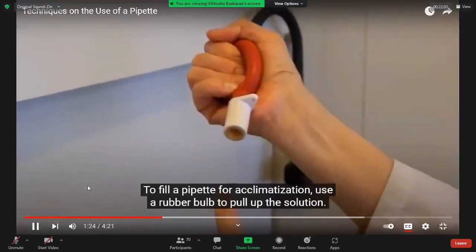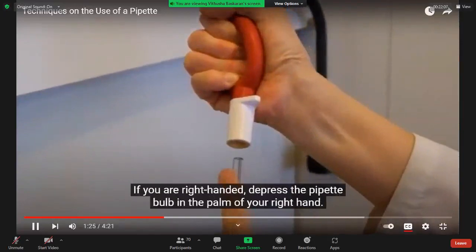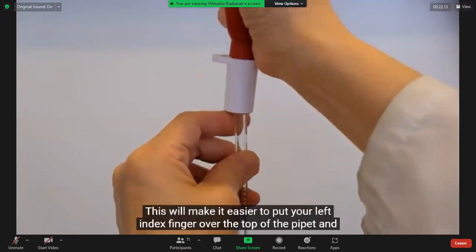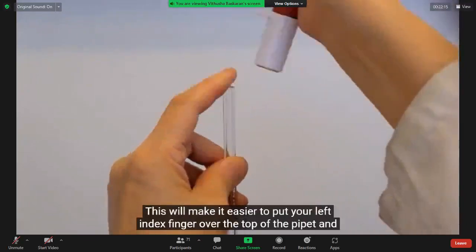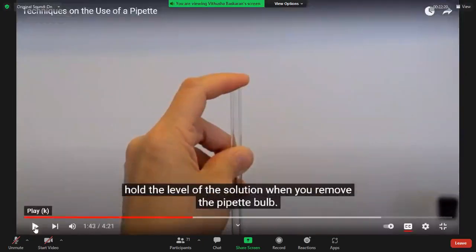Pull up the solution. If you're right-handed, depress the pipette bulb in the palm of your right hand. Hold the pipette in your left hand, but keep your index finger near the top of the pipette. This will make it easier to put your left index finger over the top of the pipette and hold the level of the solution when you remove the pipette bulb. Instead of this index finger, you can also use your thumb.